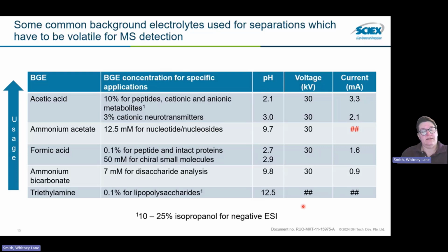You could also add, if you want to change the viscosity, you can add isopropanol. This does have the advantage of enhancing the spray capability because of the vapor pressure of the isopropanol.